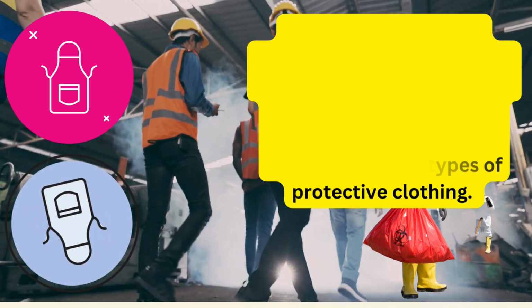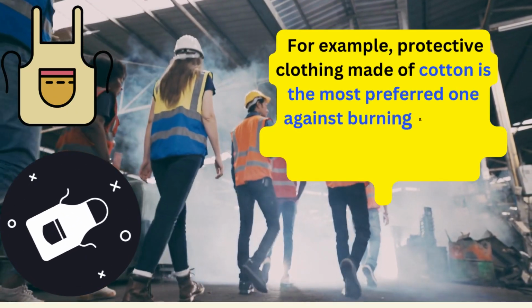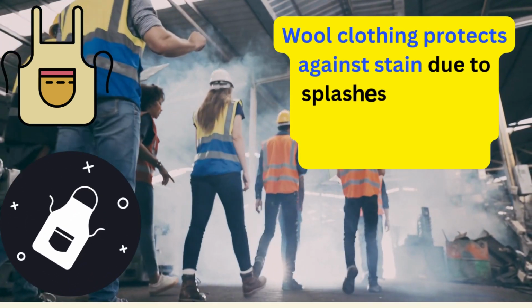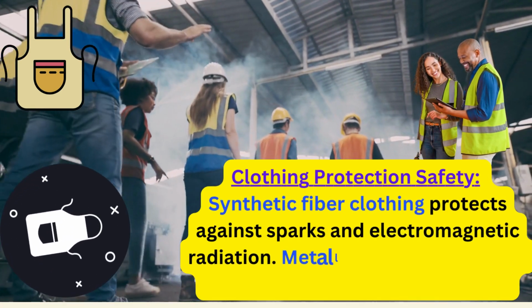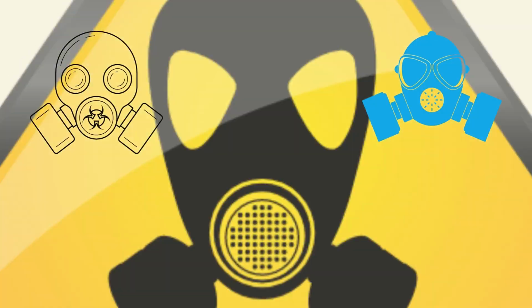There are several types of protective clothing. For example, protective clothing made of cotton is the most preferred one against burning, as many synthetic fabrics can adhere to skin when burning. Wool clothing protects against stains due to splashes of molten materials and acid and small flames. Synthetic fiber clothing protects against sparks and electromagnetic radiation. Metallic reflective clothing protects against thermal radiation.